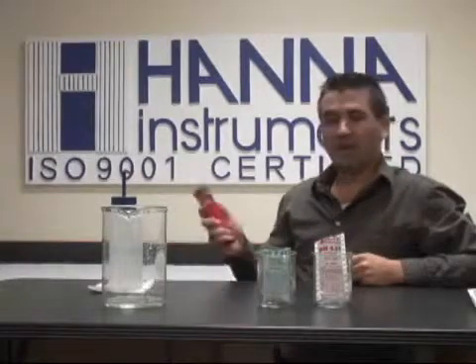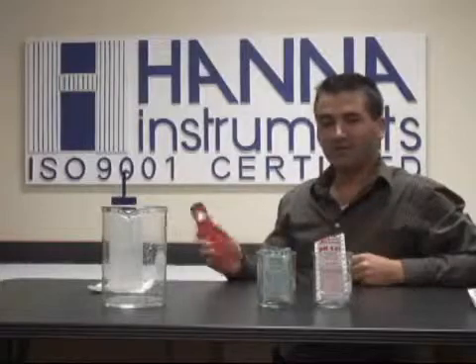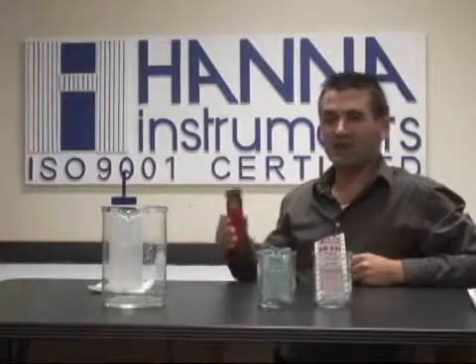Welcome to another training video presented by Hanna Instruments. I'm Michael Sylvia and I'm going to be showing you how to calibrate our pH testers that have auto calibration. That would be our 981827, 981828s, as well as the combo testers.